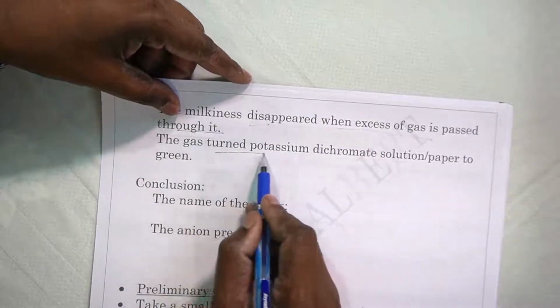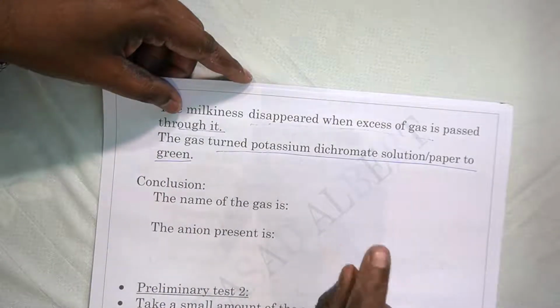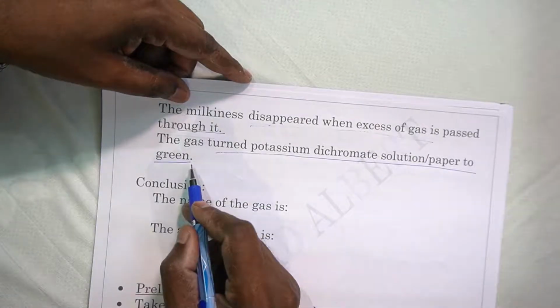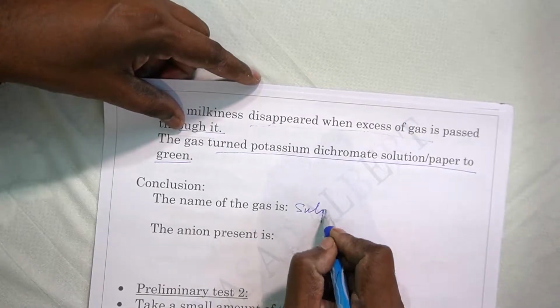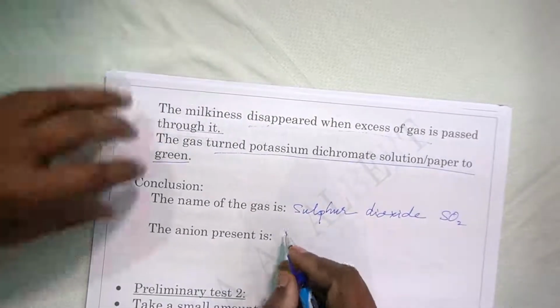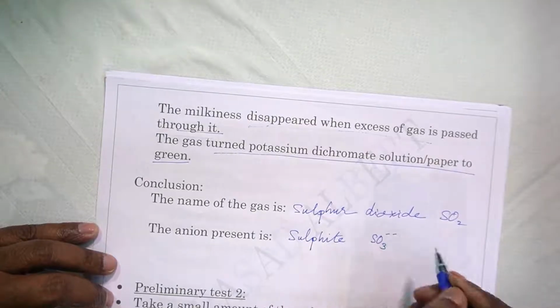The milkiness disappears in excess, all of that is the same as carbon dioxide, but this is a different one. That is, the gas turns potassium dichromate paper green. You dip a filter paper in potassium dichromate solution and introduce it to the gas. The potassium dichromate paper is usually yellowish, but when introduced to the gas, it turns green. That shows the gas is sulfur dioxide. What is the gas? Sulfur dioxide. The formula is SO2. So the anion present here is sulfite, SO3 minus minus.